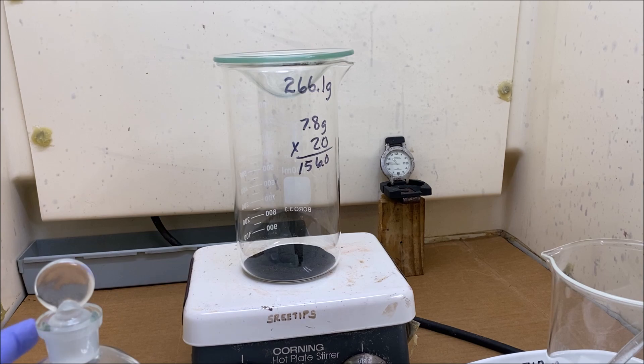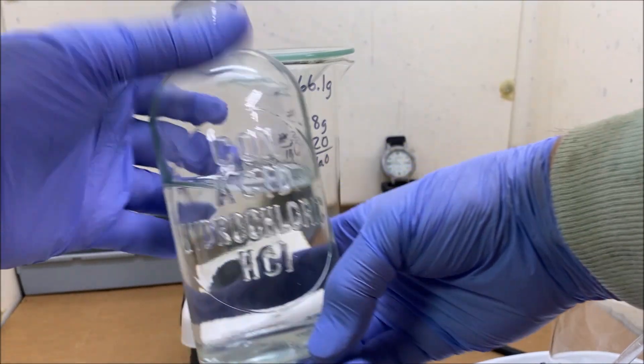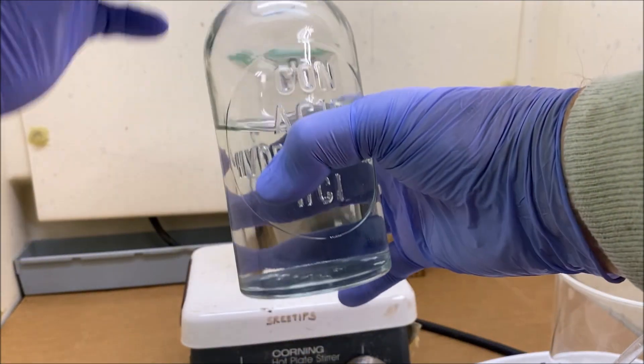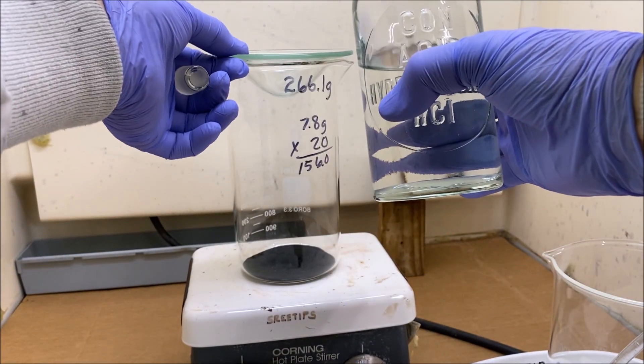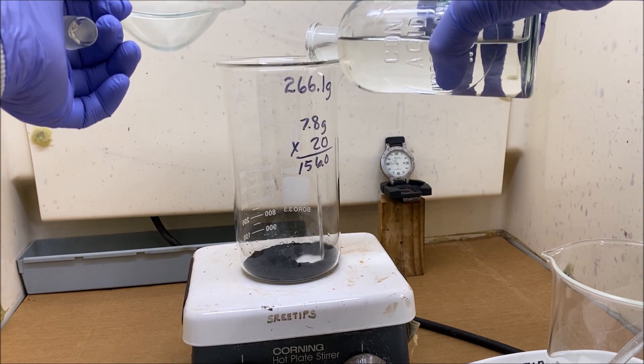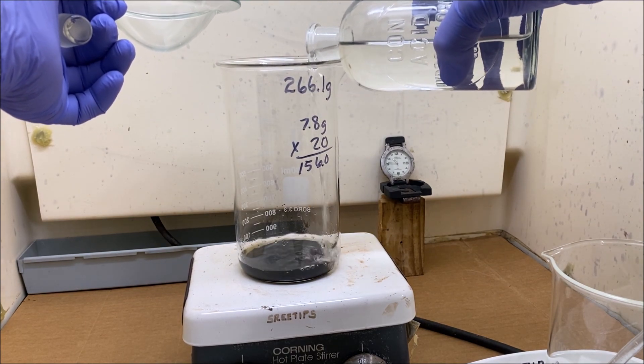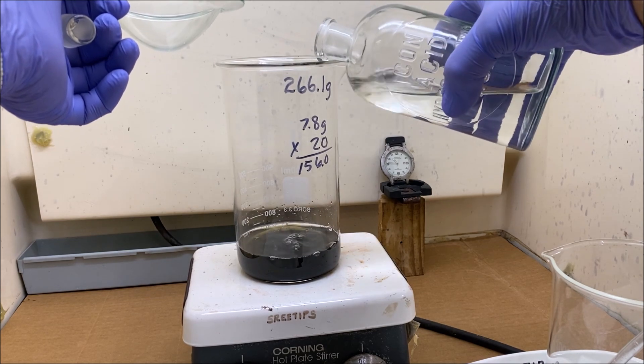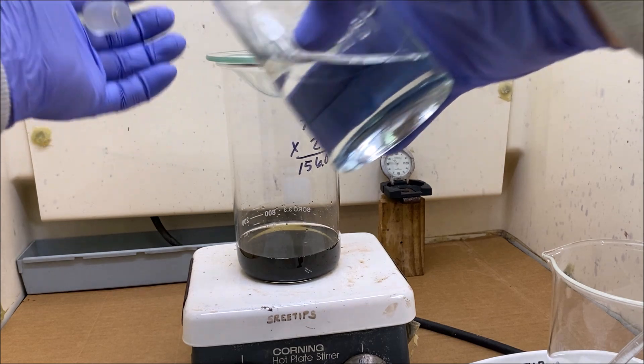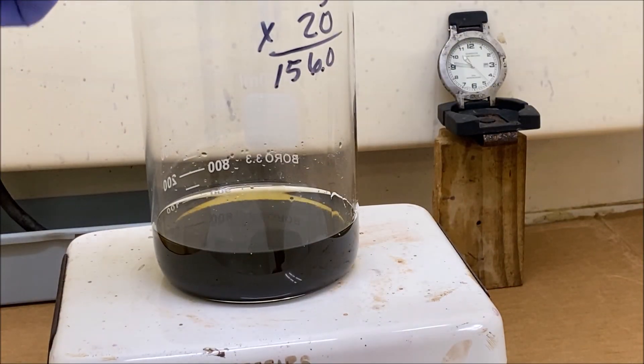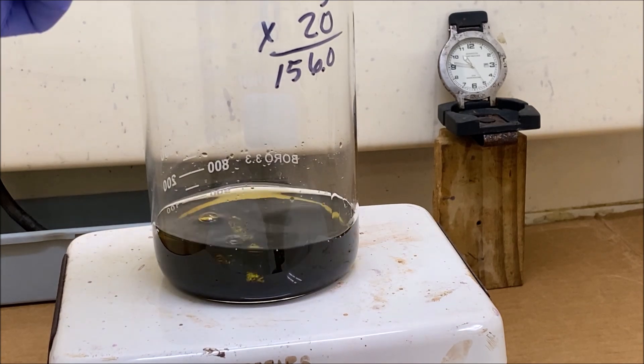Welcome back to part 4 of the dental scrap recovery and refining. I'm adding some hydrochloric acid to our mixed black PGM powders in here. I've got a stir bar. I'm going to drop that in and start the stirring.